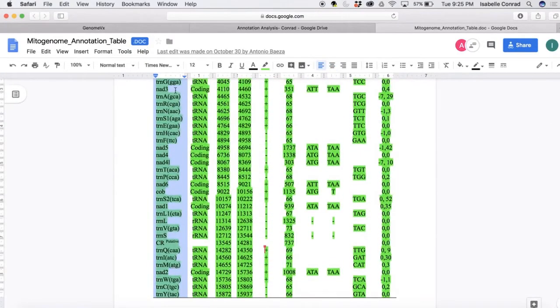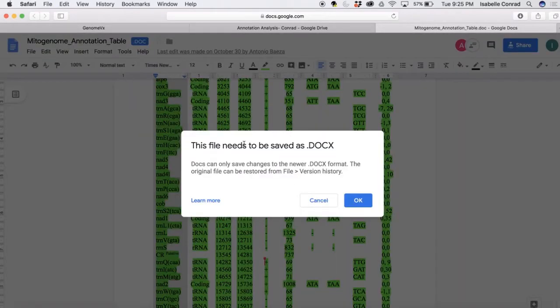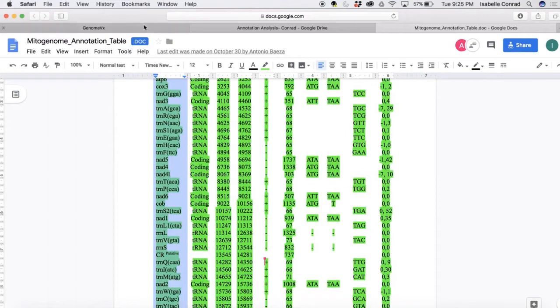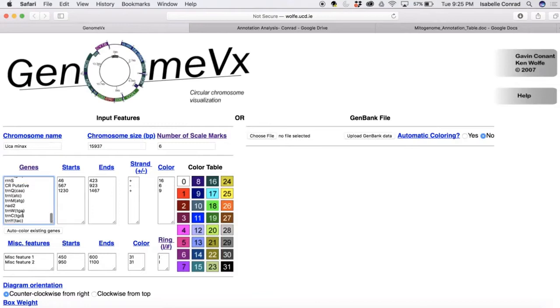So we are going to copy this row and then go back to the website and paste the genes under the genes column.